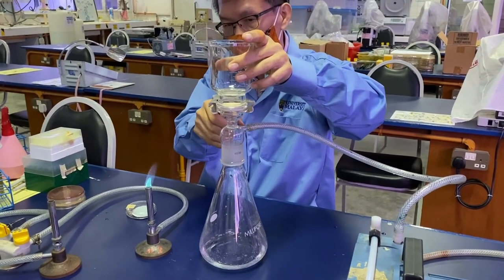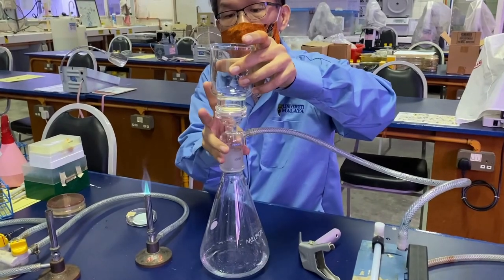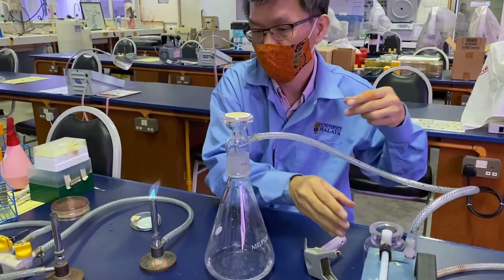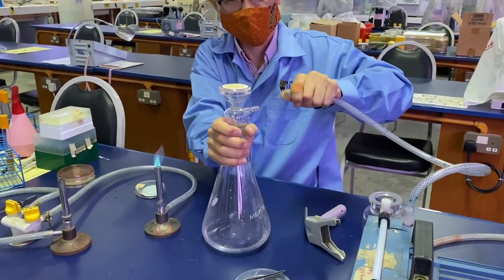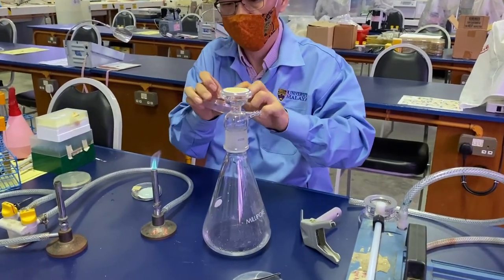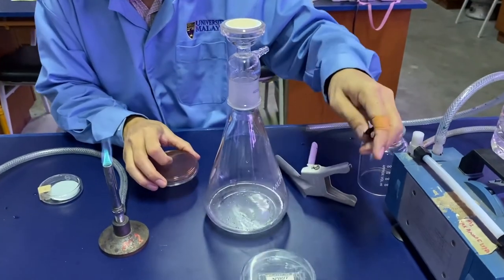Slowly remove the funnel and remove the tubing in order to release the pressure. We are then going to place the membrane filter onto a McConkey agar plate.